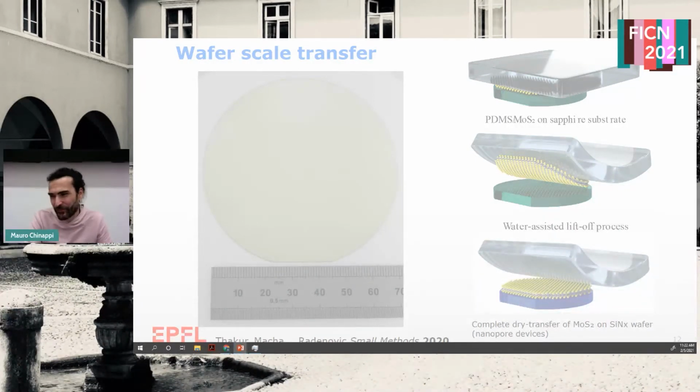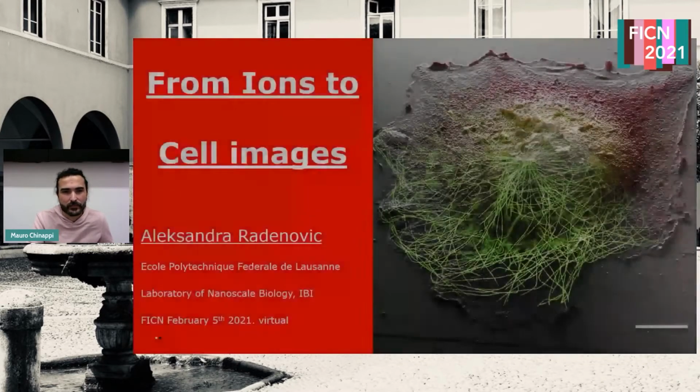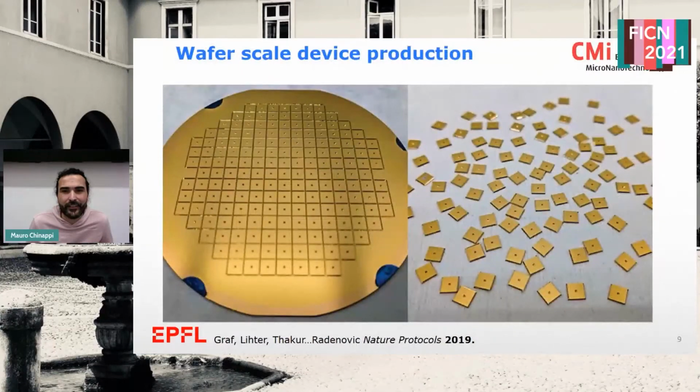So yeah, I will continue. What we want to do is really not to spend the time transferring one device by one device, but we want to transfer the whole wafer of grown material onto our substrate wafer.